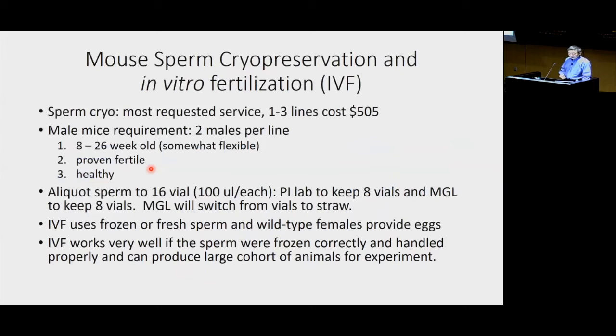And when I look at the epididymis, they are very thin and pale, and don't have many live sperm around. In that case, when you try to recover your mutant line, it can be a problem. So hopefully your male is also healthy. People have cryoed males as old as almost 2 years, and it worked.